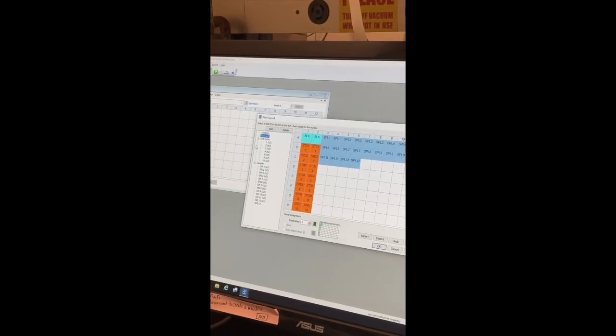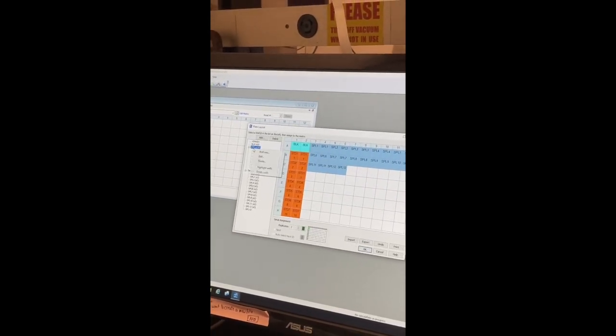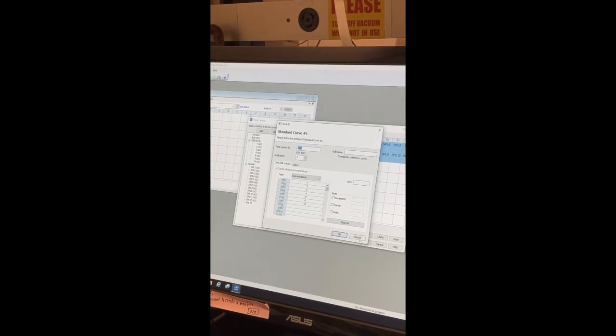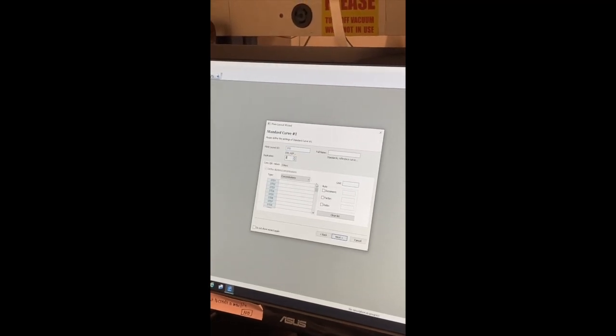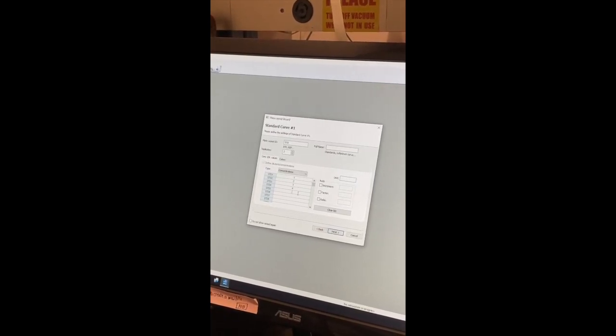Blank, replicates 2, standard. And it's like certain numbers. 1, 2, 3, 4, 6, 8, 10. Okay, ready again. And you want your standards in duplicates, and you want them at 1, 2, 3, 4, 6, 8, and 10.